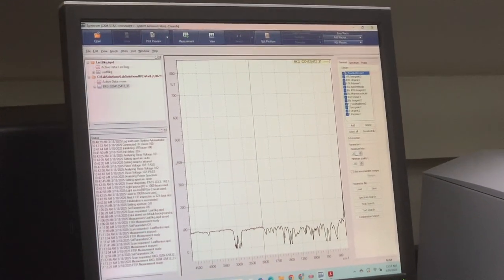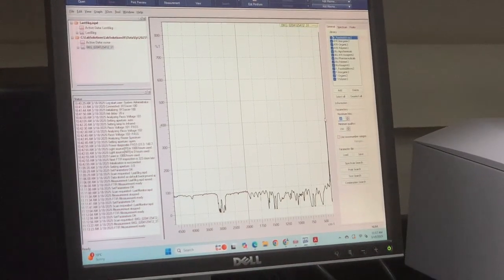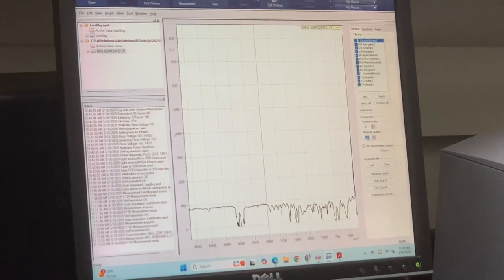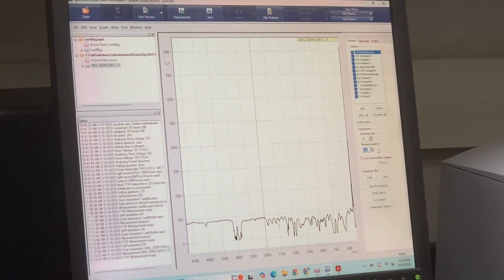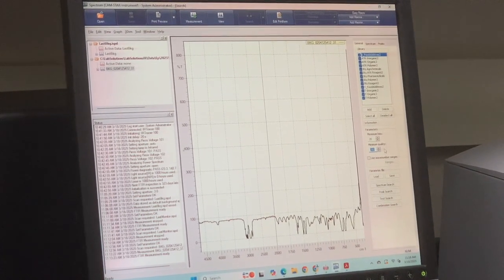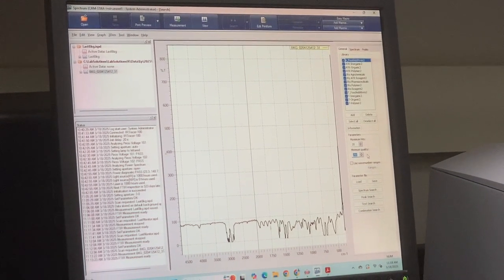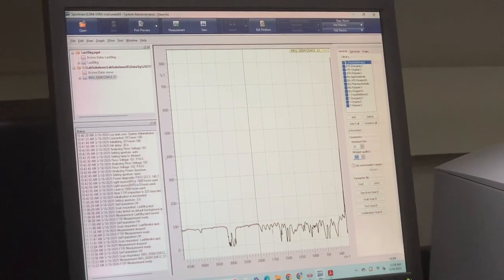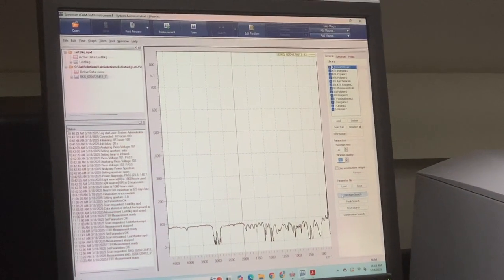Right now, I'm asking it to give me 20 hits, so 20 options to choose from. And this is a quality number out of 1,000. In this case, they don't really need to be that close: 250 out of 1,000, 25% similar. It's kind of like dimensionless. If you went to 1,000 out of 1,000, it would have to be a perfect match for it to show. So that's what minimum quality metric means. So let's just go ahead and spectrum search.